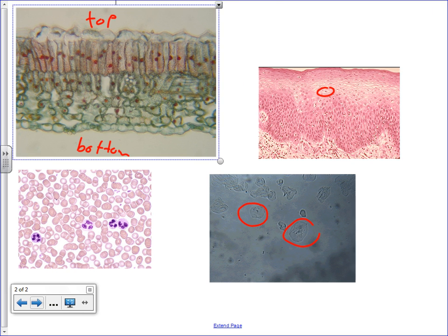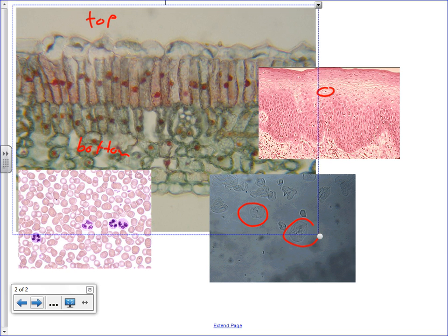If we blow that up a little bit, you can clearly see the nucleus. Your nucleus may not be stained red in yours. In some of the slides, it's stained red, and in some it's kind of grayish green, but it's a big dot in the middle. It'll be obvious. You can also see quite clearly all the chloroplasts around the edges of the cells. And some of the cells, like this one here, are clear in the middle. This one has a clear section in one spot.